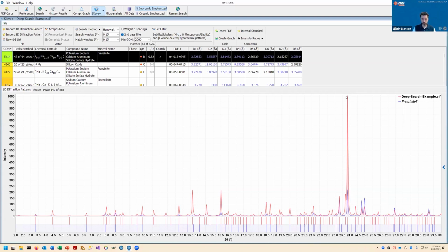All right, so what's going on? Well, I know I'm missing data in this 1D diffraction pattern. And basically what had happened is when this pattern was exported, the true strong peak was actually truncated from the data. So this is actually missing the strong peak.